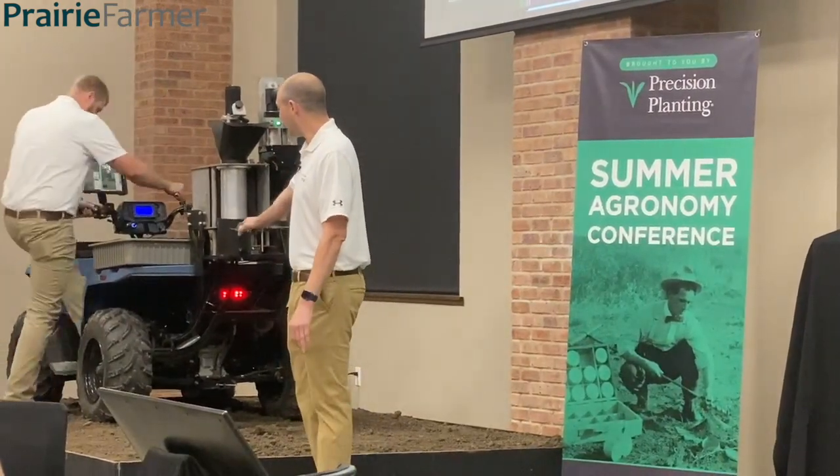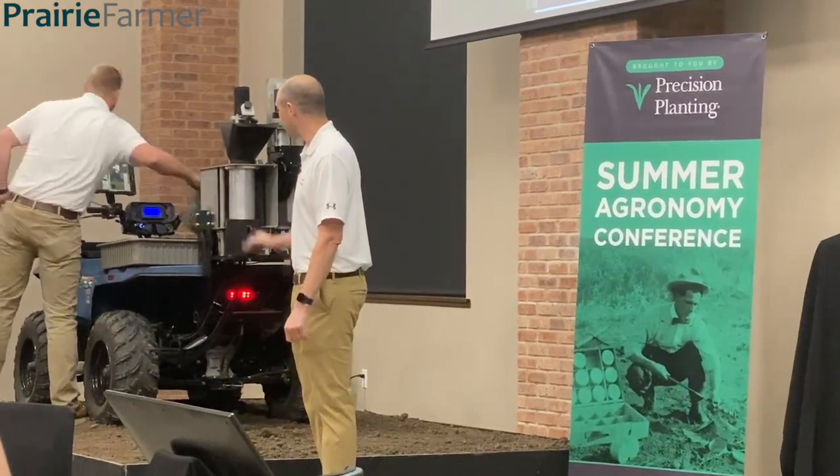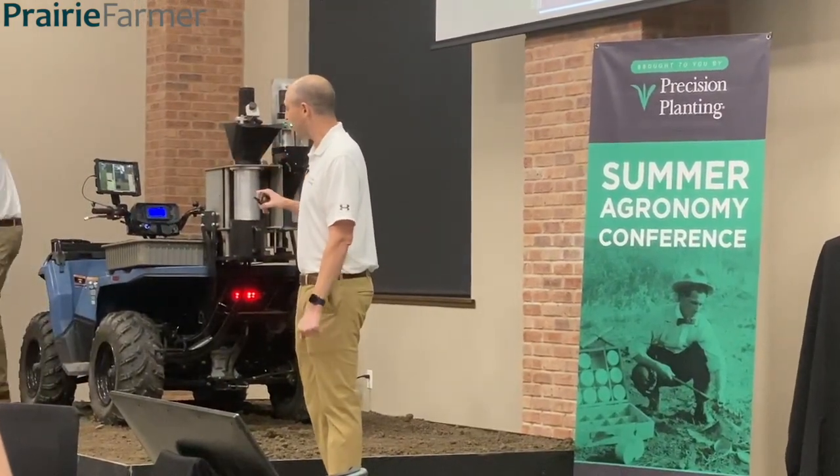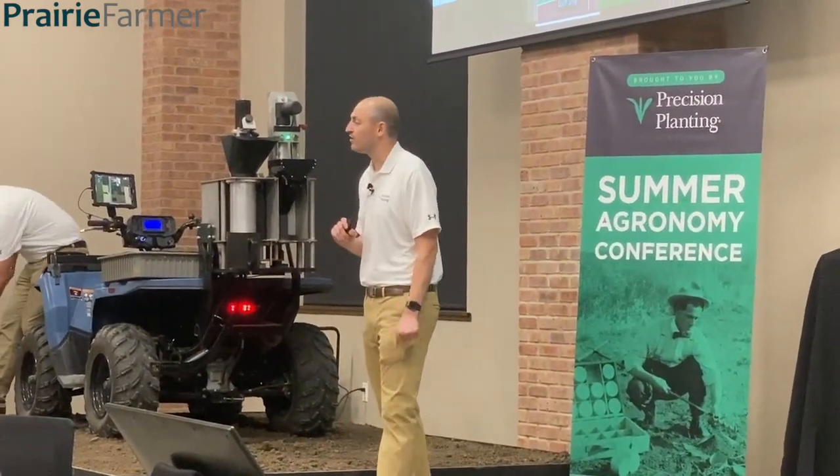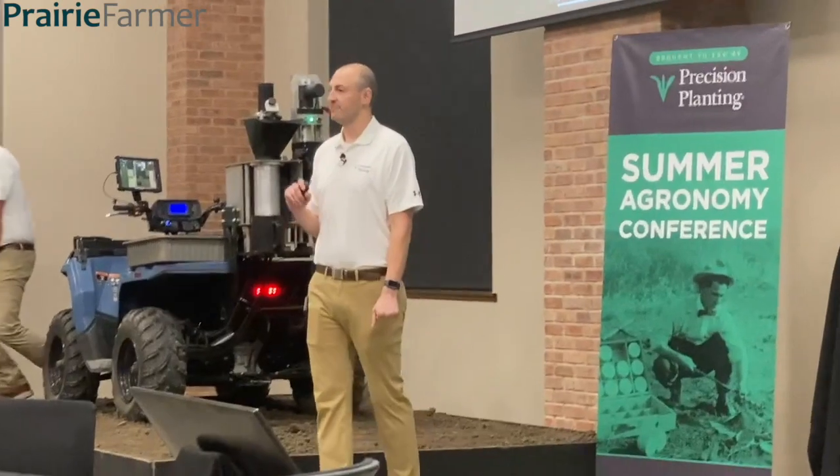At this point, we have the sample processed. Eli is going to jump off, and you're going to start collecting your next soil sample, and then we're going to load the next sample automatically for you.